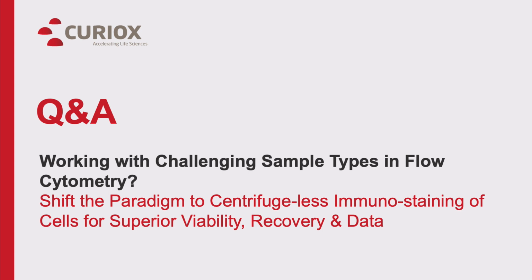Do the nozzles for dispensing and aspiration of wash need to be cleaned, and are they disposable? Good question. No, they're not disposable, but when you set up the system and you prime it and you close it down, there's a protocol that you need to go through to prime the cells and shut the instrument down that basically cleans all of those systems. So it's very much almost like the fluidics on a flow cytometer. So, you clean that out, you let it sit overnight. I believe you clean with ethanol, then let it sit with water. Then the next morning you have to reprime the system before you run.